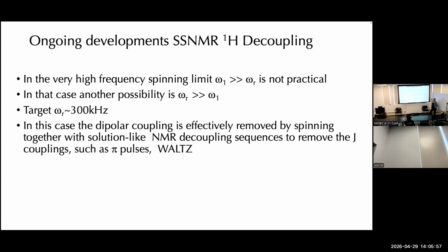60, 111, these are commonly used rotors. 60 is the 1.2 or 1.3 millimeter OD. 111 is a 0.7 millimeter OD. But the cool thing about it is you get so little material, less than a milligram. And you get a reasonable spectrum, and in many ways it's better resolved. Not much material in there. Other challenges, there are definitely other challenges, we can talk more about that, but anyway, the field is making a lot of headway towards this target of being up around 300, 500 kilohertz, but you're not going to be using RF that's 3 times higher than that, I don't think, not today.